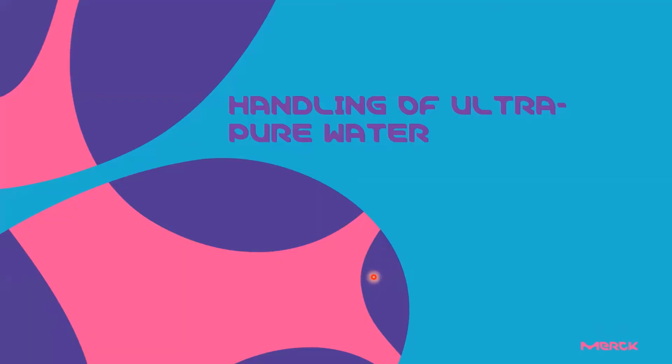So we have looked at the water purity, the definition of water purity. We have looked at the contaminants in the water. We have also looked at the purification technologies that are available. We have also looked at the parameters that we need to check. Really very important are the TOC and resistivity. And now when we have pure water or ultrapure water, how do we handle this? So I just want us to look at how we handle the ultrapure water.